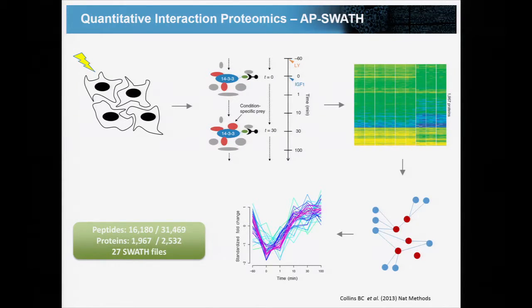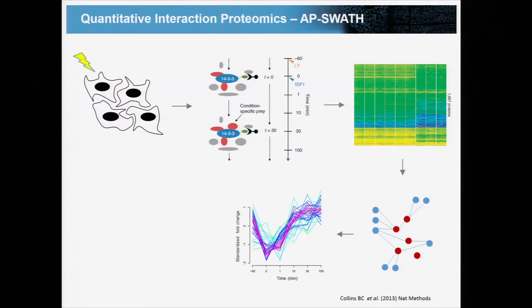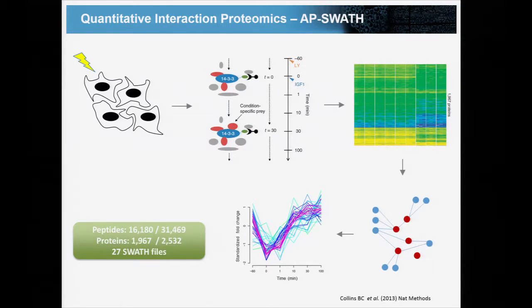And for this, it was a relatively focused sub-proteome experiment, but we had no particular list of targets that we were interested in quantifying. We just wanted to see what we could see. So we generated the spectral library internally in the experiment by DDA, and then we took that same library and the same samples shot in SWATH mode, and we used that library to extract the quantitative data.